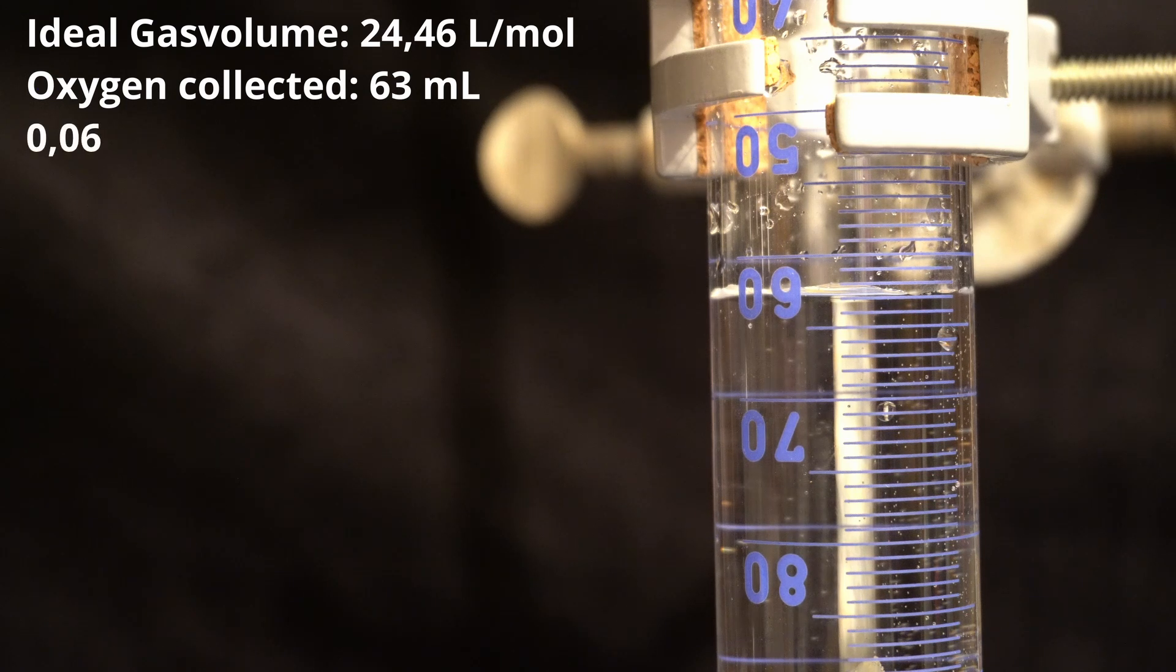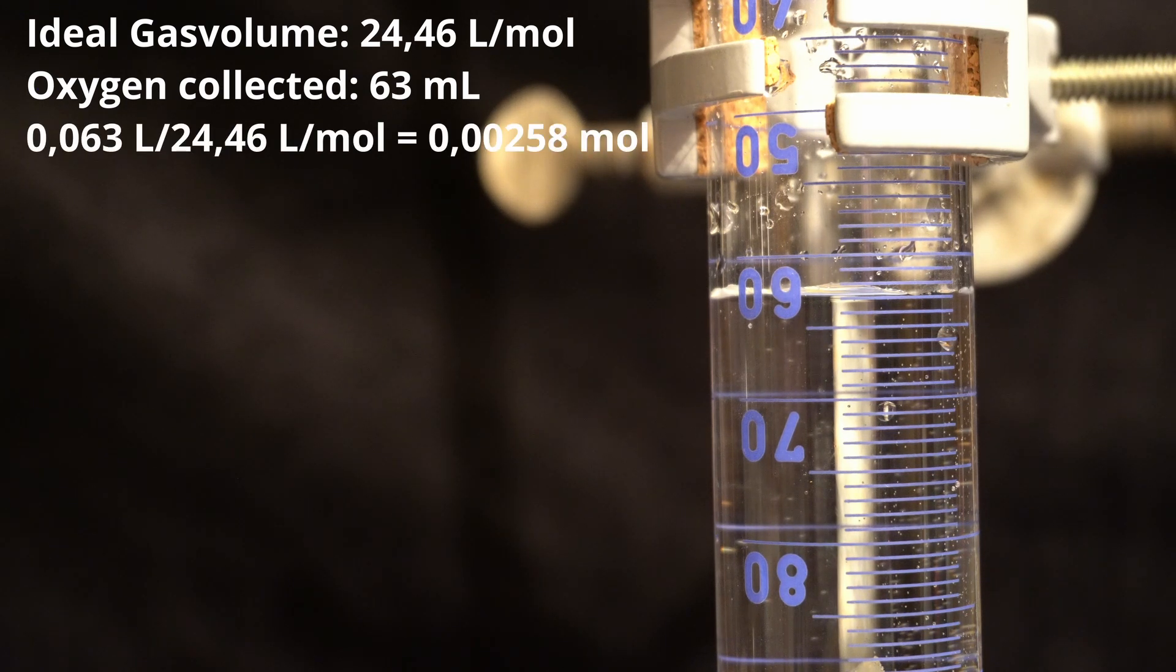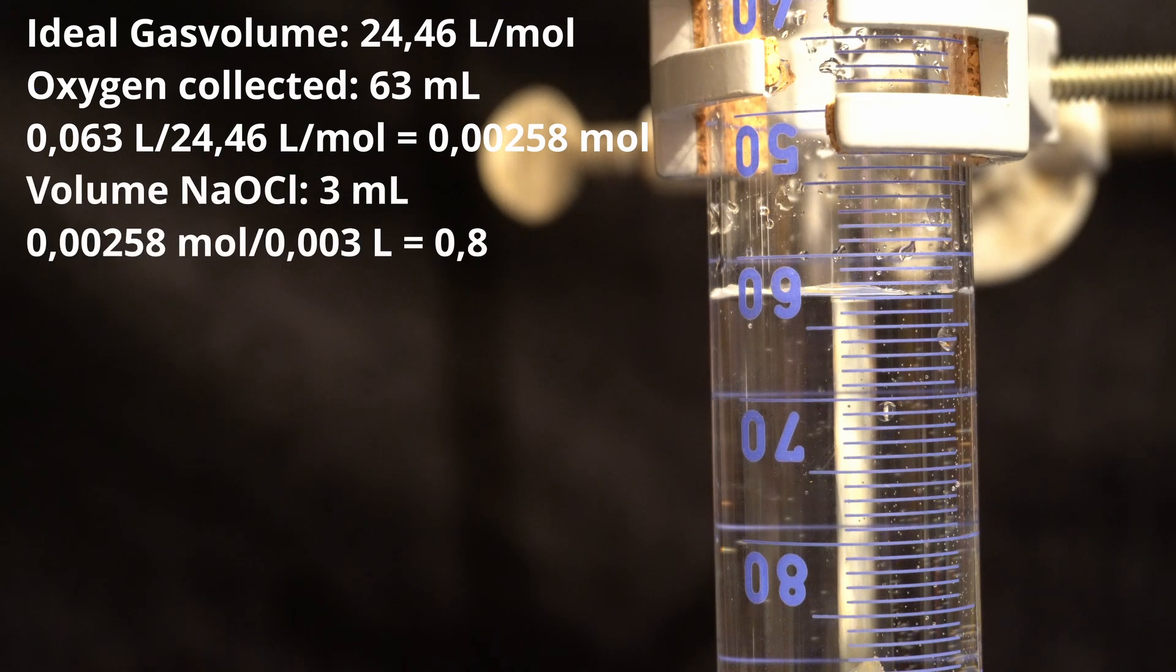This corresponds to 0.00258 moles of oxygen. I put in 3 mL of hypochlorite in the flask, meaning the concentration of my hypochlorite is 0.85 moles per liter, which is equivalent to 5.2%. This explains the terrible yield and also the white precipitate when dissolving the sodium hydroxide in the hypochlorite.